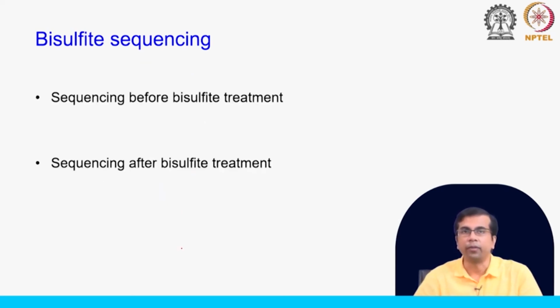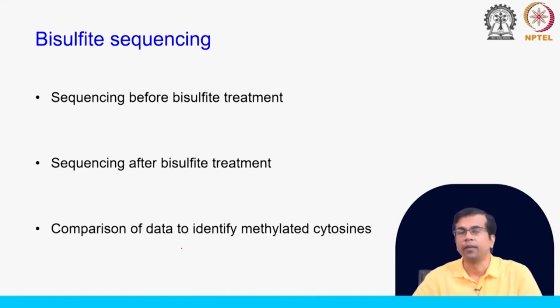So, what we do is we sequence before bisulfite treatment and sequence after bisulfite treatment, and then we can simply compare and identify which are the methylated cytosines and which are unmethylated.